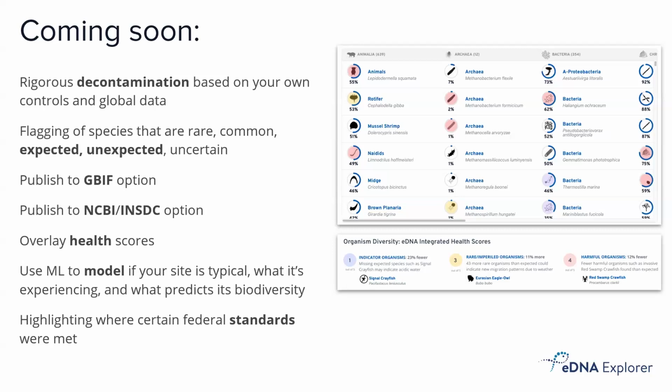And we're going to be using more and more machine learning to model if your site's looking typical. What is it experiencing? And how can you predict biodiversity change for the future?